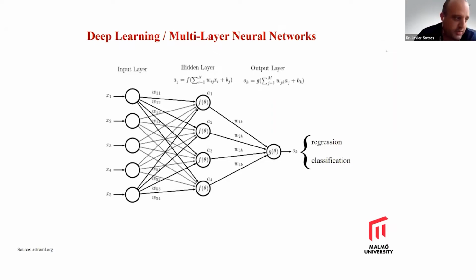When you talk about supervised deep learning, this is what we have used for this work. Basically, what you do is feed these functions with a lot of data where you know the outcome, and you just do fitting. Of course, when you play with such complex functions, you need a lot of tricks for this fitting.